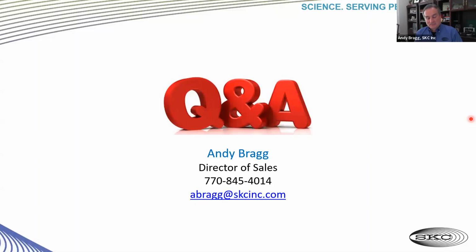Okay, thanks. I think we've got time for just one more question. Are PPI samplers for the respirable fraction recommended for measuring worker exposure to welding fumes, specifically for addressing the ACGIH respirable TLV for manganese? Why not? They're collecting the respirable fraction. There should be no issues with that. And if there are any recommendations, I really don't know. Dusty? Yeah, we sell plenty of the PPIs with MCE filters specifically for welding respirable particles. So yeah.